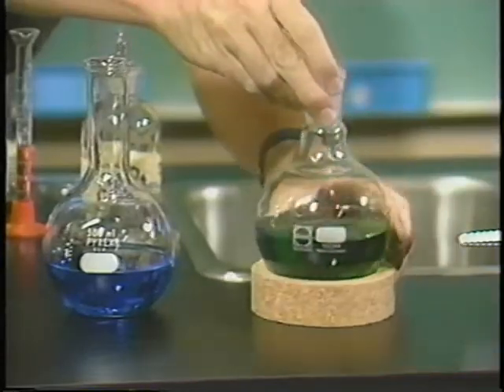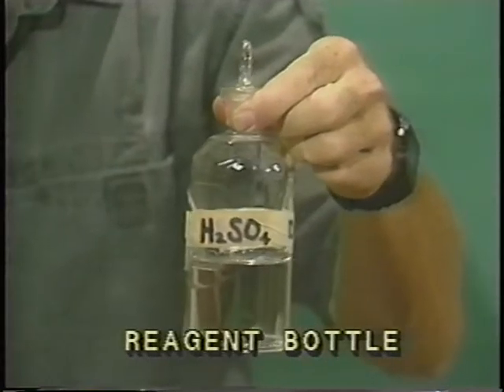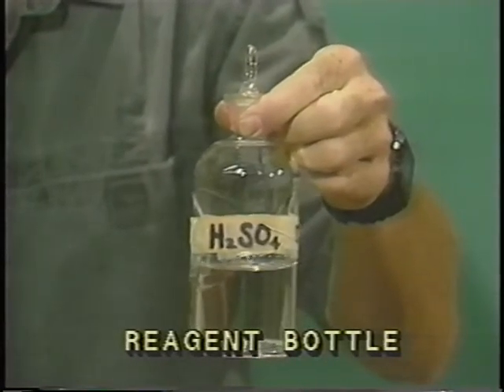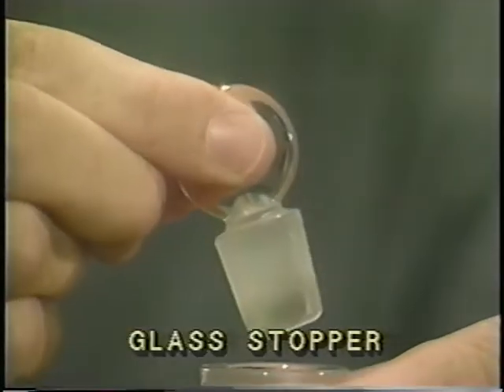Otherwise, it'll fall over. Then we have what we call a reagent bottle. This particular reagent bottle has sulfuric acid in it. The stopper at the top is called just that, a glass stopper.